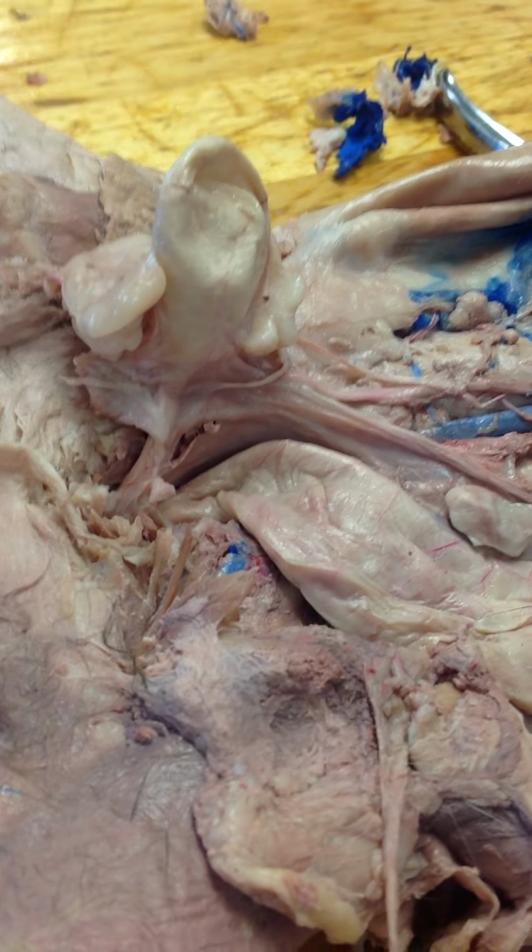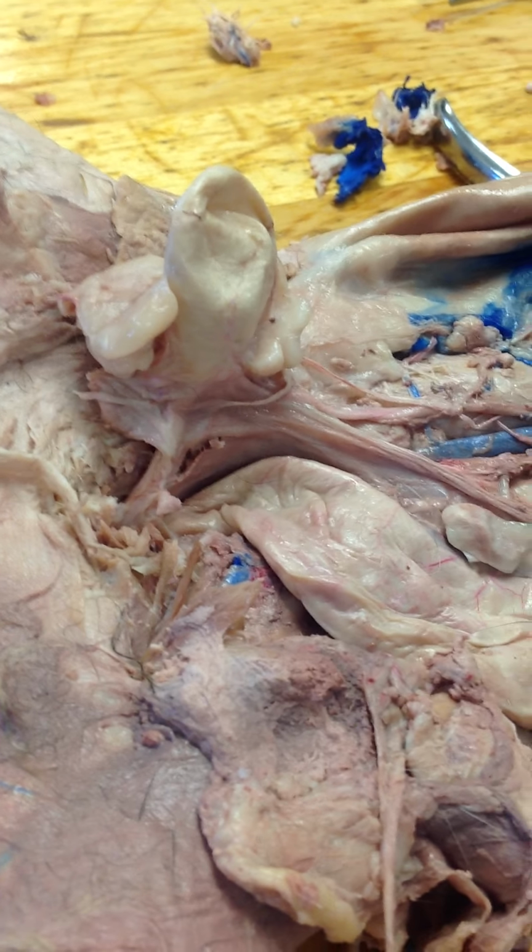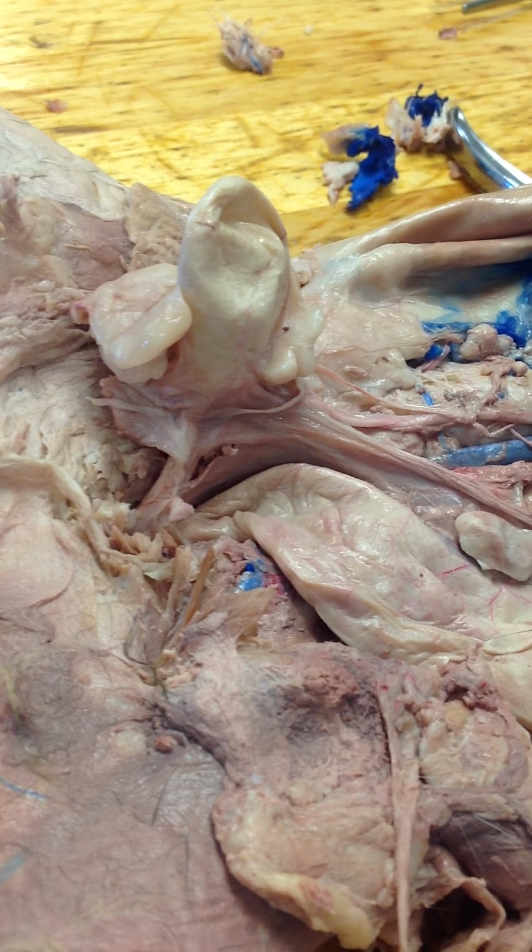Yeah, we have to find the renal sinus. That's the last one. Where's the renal sinus? Isn't it just the thing where it all collects? The pelvis. It's not on there, it's not labeled. I want the hilus. The concavity on the medial side of the kidney.